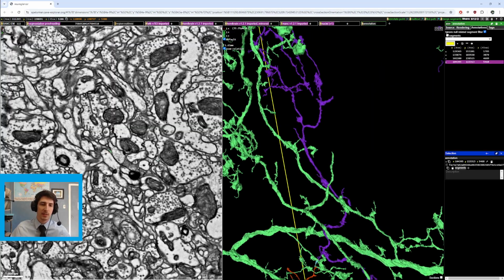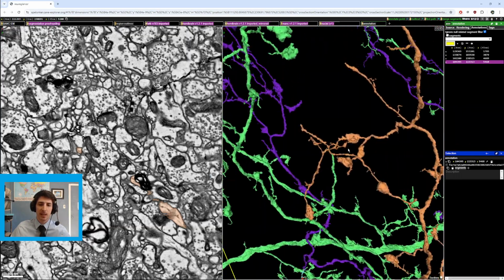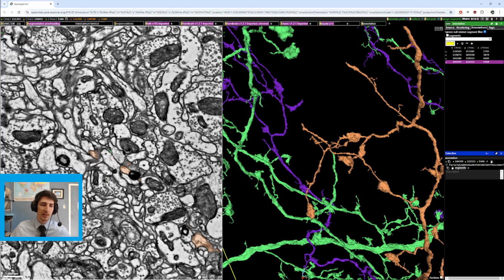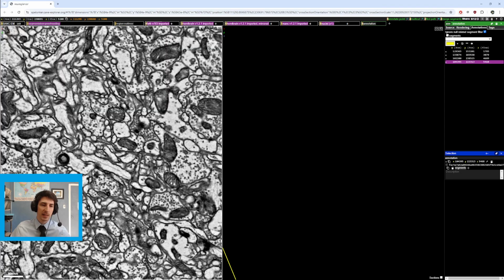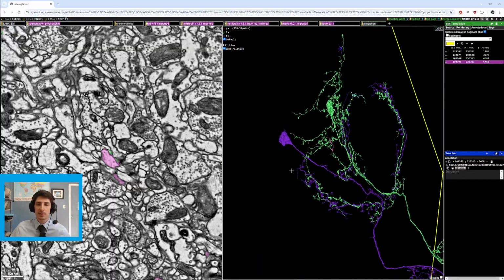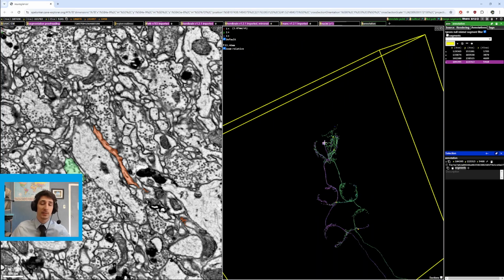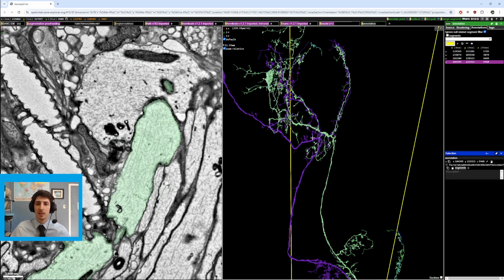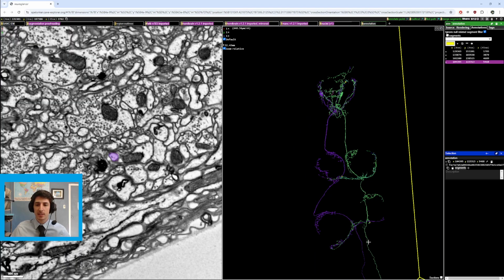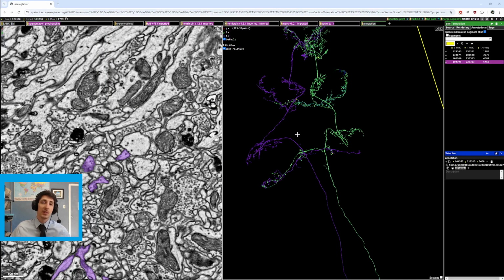This green branch is pretty thick, so probably want to get that. That looks weird. There you go. So there's a little slide jump. You can see this one kind of pops down here. That's a decent sized branch. Always worth getting those types of branches, but in this scenario we have, I would say, 95% of the cell now. If we get rid of that merger, if we add these two branches and make sure to split off that part.